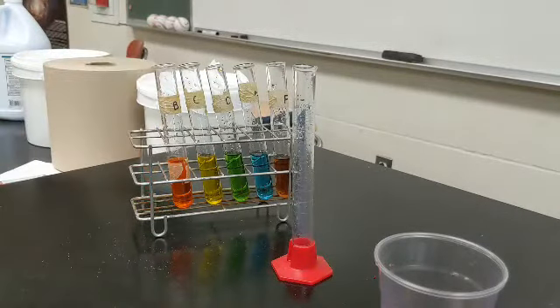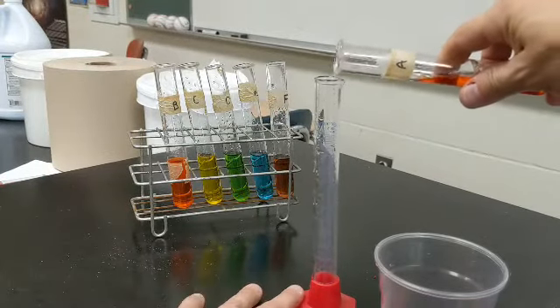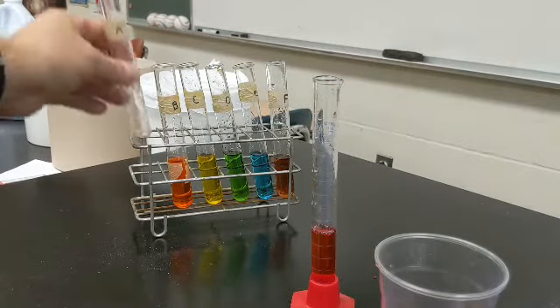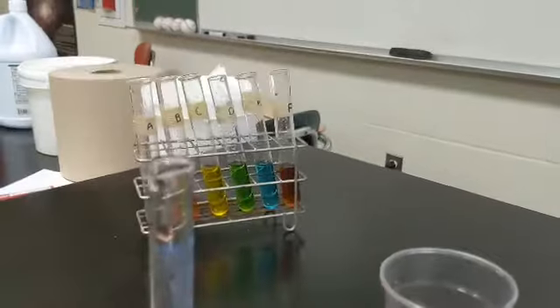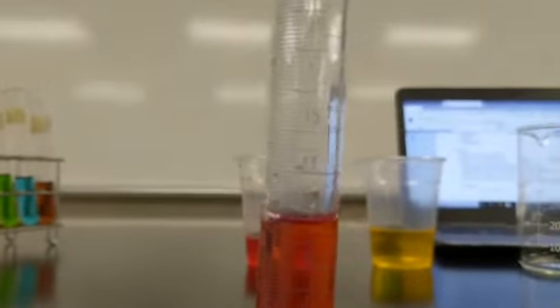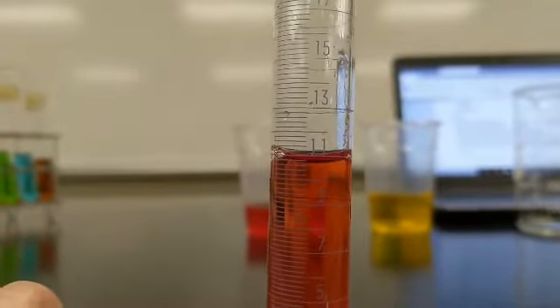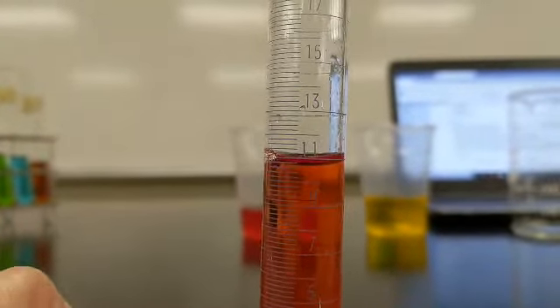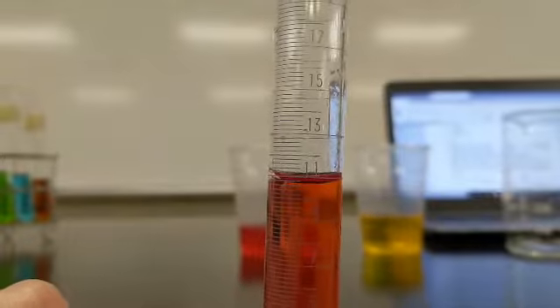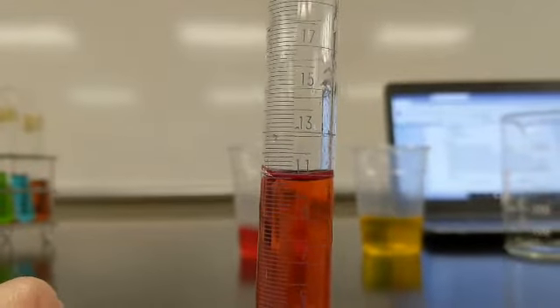Okay, let's take a look at the final volume for test tube A. What do you think? Is that 11, or would that be a little less than 11 if we're looking at the bottom of that meniscus? I think it's a little less than 11. I think it's just below that 11 line. So we're going to call that 10.8 milliliters.